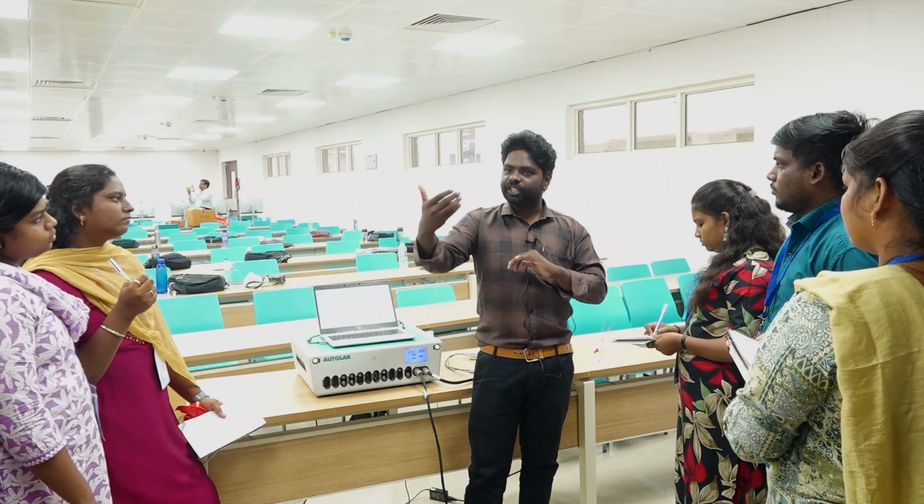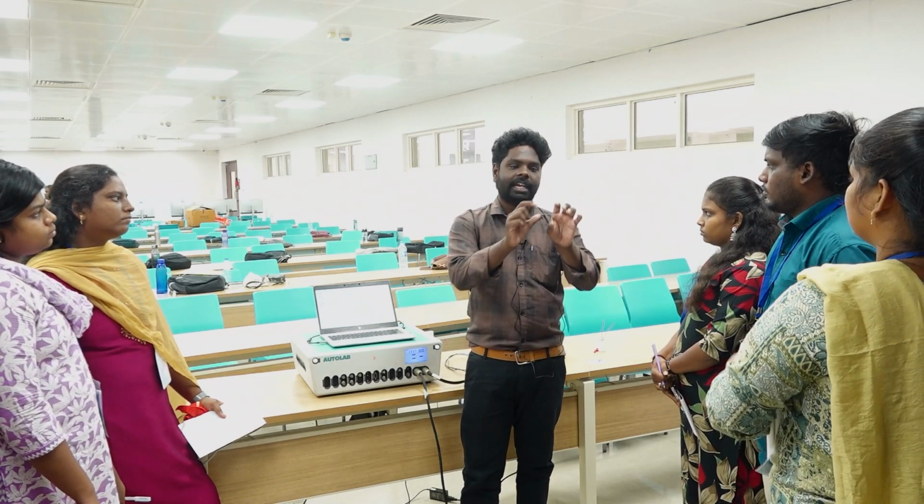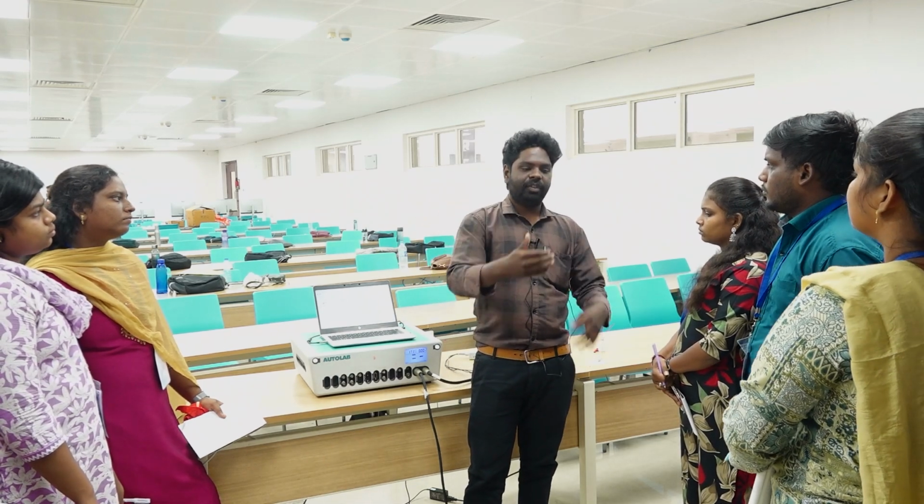So if you run an EIS, you will get data that is just data only, not a direct result. Once you get the data, you have to interpret it. That interpretation is very, very important here. It's not like other analytical instruments where we get direct results in ppm. Here we only get the data, and after that we have to analyze, that means interpret, the data. That interpretation is very, very important. So this is the basic information for EIS.